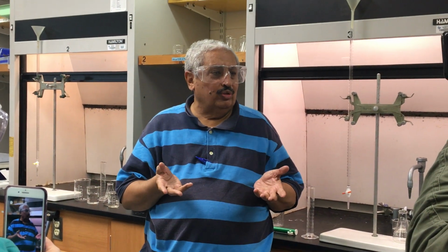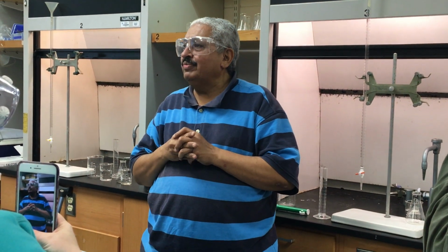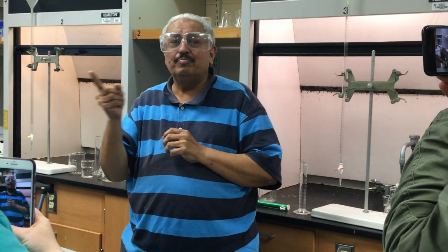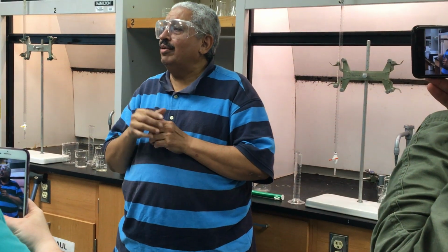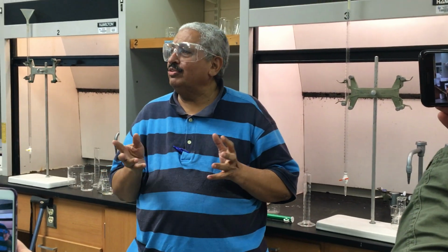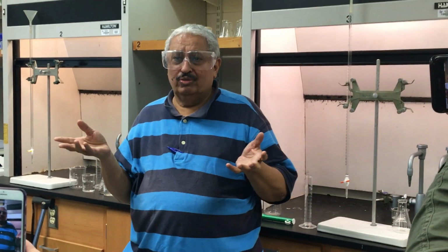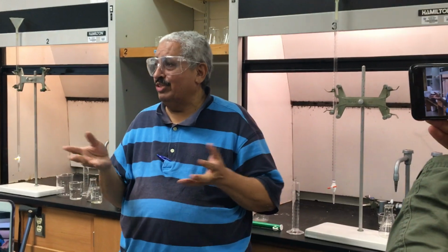Both of them have no odor, no smell. But how can I tell this is an acid or base? Can somebody help me? So how do you tell? Litmus paper. Litmus paper, that's good.